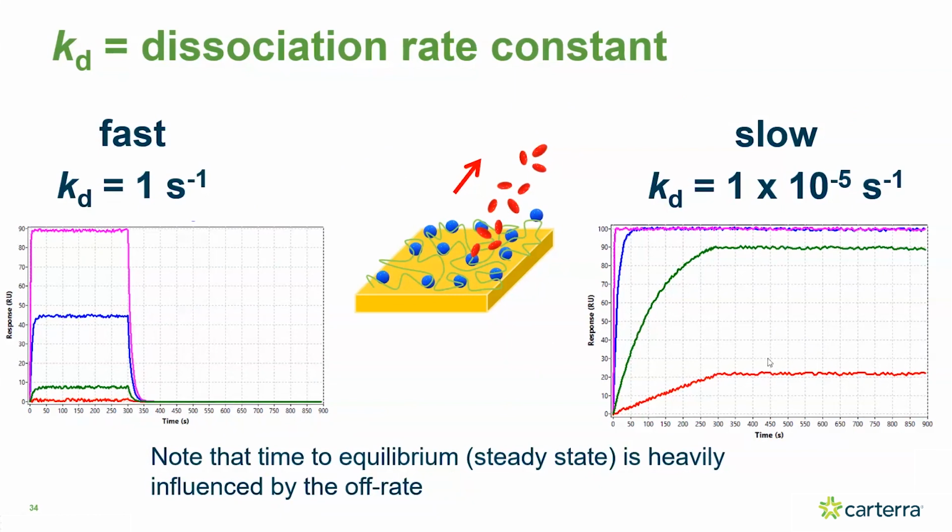There are antibodies that have dissociation properties slower than this. They actually become very difficult to measure with SPR. You can see that there's almost no visual dissociation in this 10-minute dissociation time shown here with this off rate. We actually use 1 × 10⁻⁵ as a default fitting limit in the LSA software. It can obviously be changed if you want to try to rigorously design an experiment that will elucidate more dissociation.